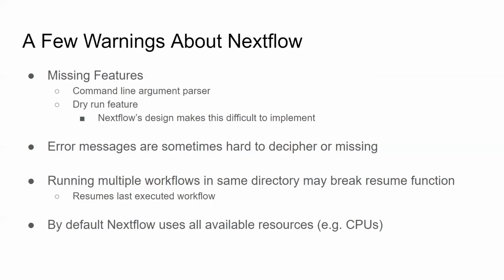Also, the resume function is sometimes easy to break. So Nextflow does resume, which tends to work great. But if you run multiple workflows in the same directory, you might end up breaking the resume function for another workflow, because it tends to only resume the last executed workflow.